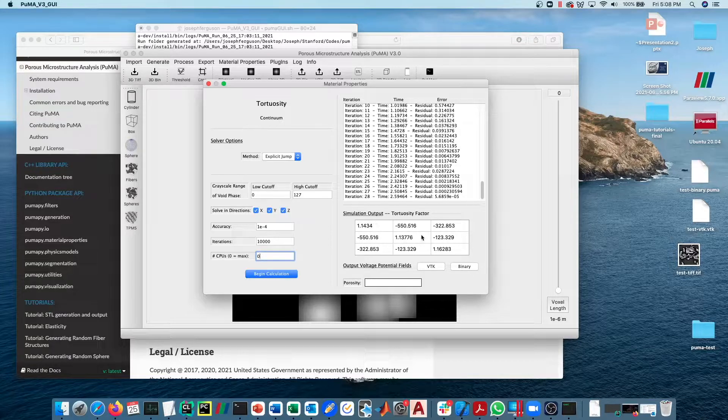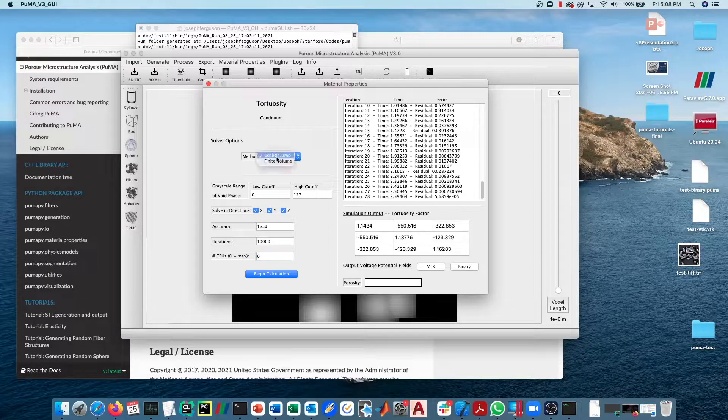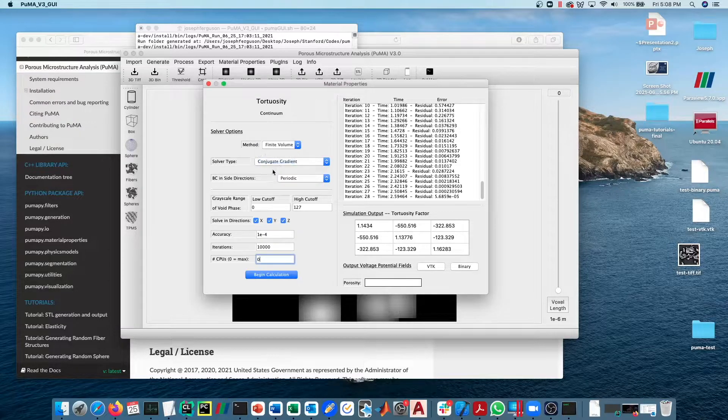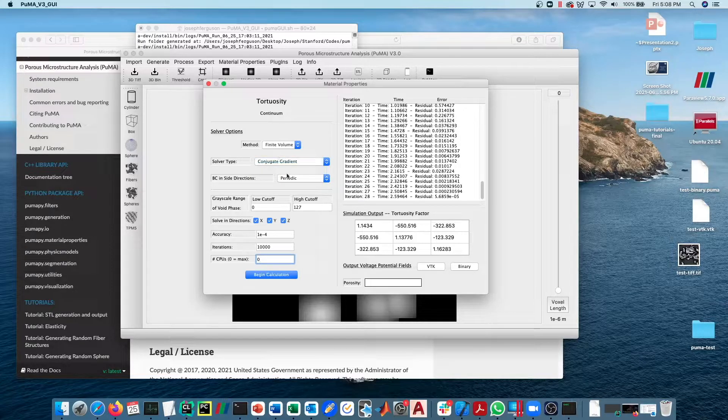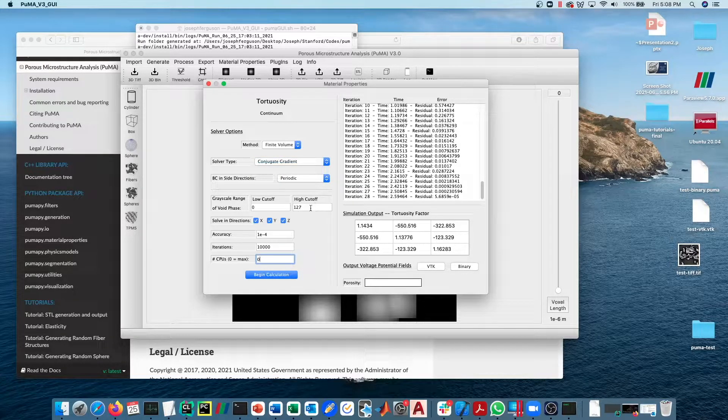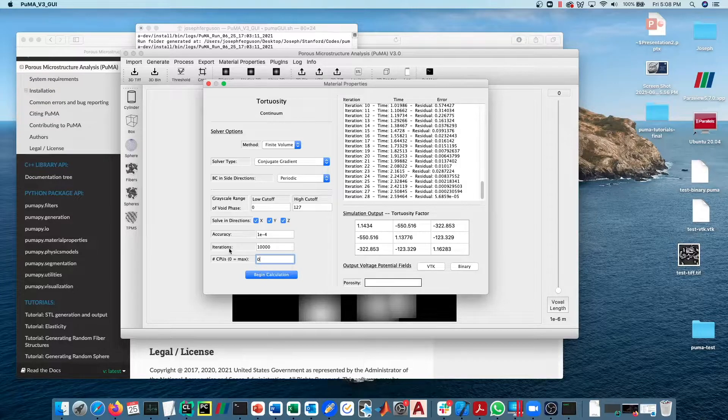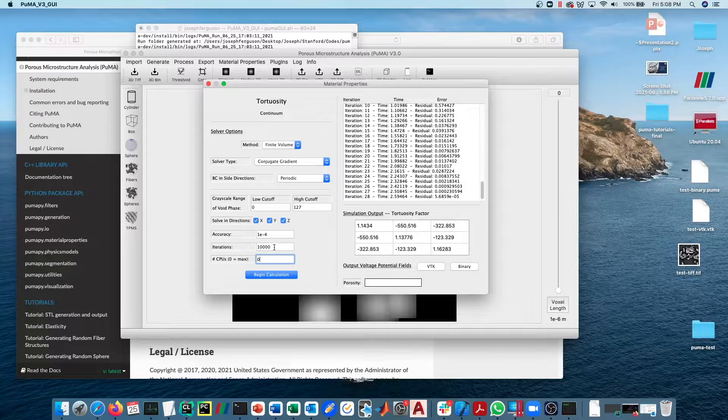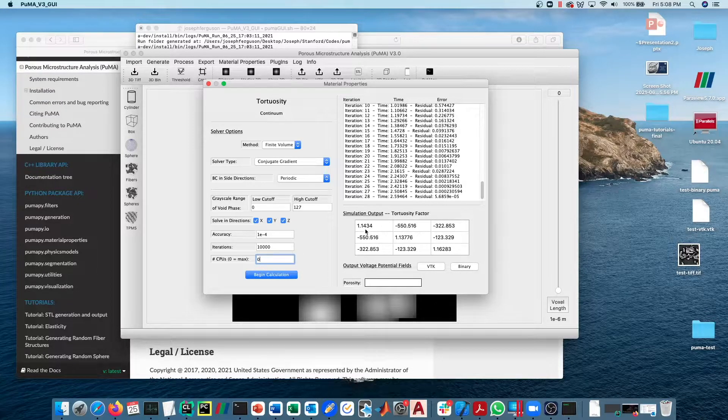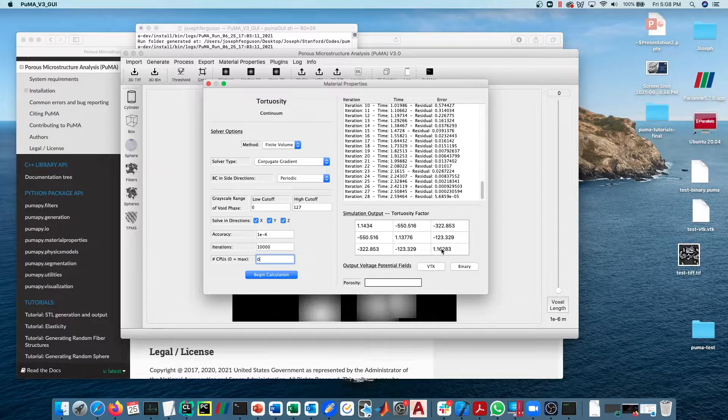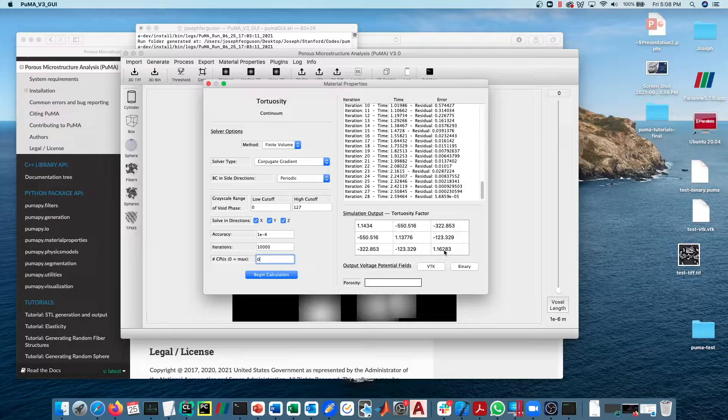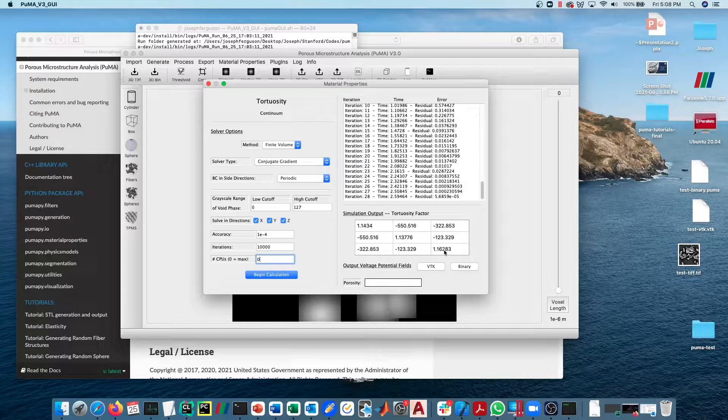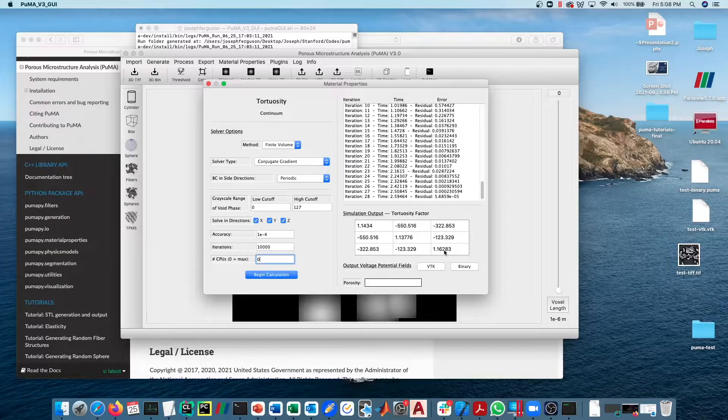We're going to do the same calculation using the finite volume solver with the conjugate gradient method: zero to 127, same accuracy, same solver directions, iterations 10,000. This should result in an almost identical solution.